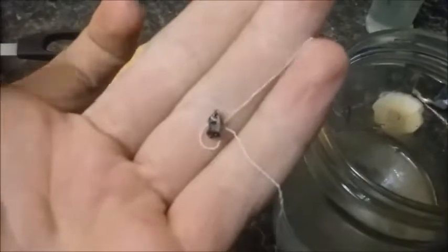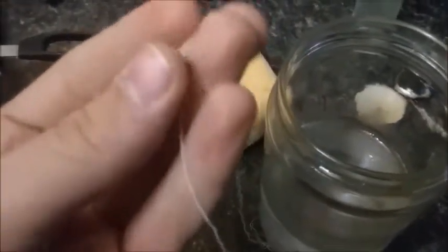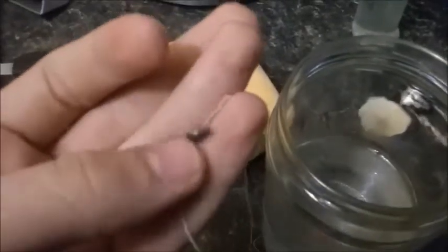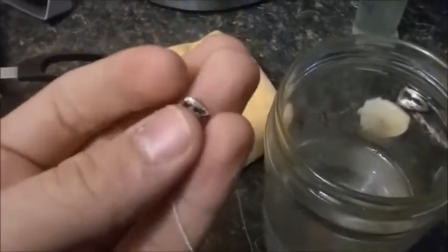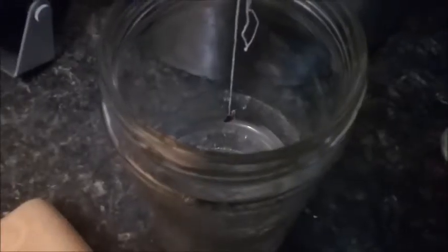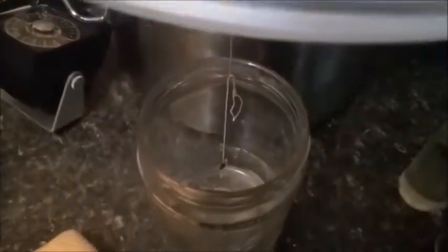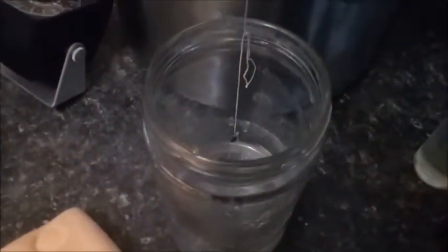I'm curious to see how lithium would react with water if it were under a vacuum. My guess is that it's going to react a little bit stronger because the water will be boiling, but we will see. Here I have my setup with magnets, which I will be using to drop the lithium from outside of the chamber. I'm going to put this in the chamber, vacuum it down, and show you then.